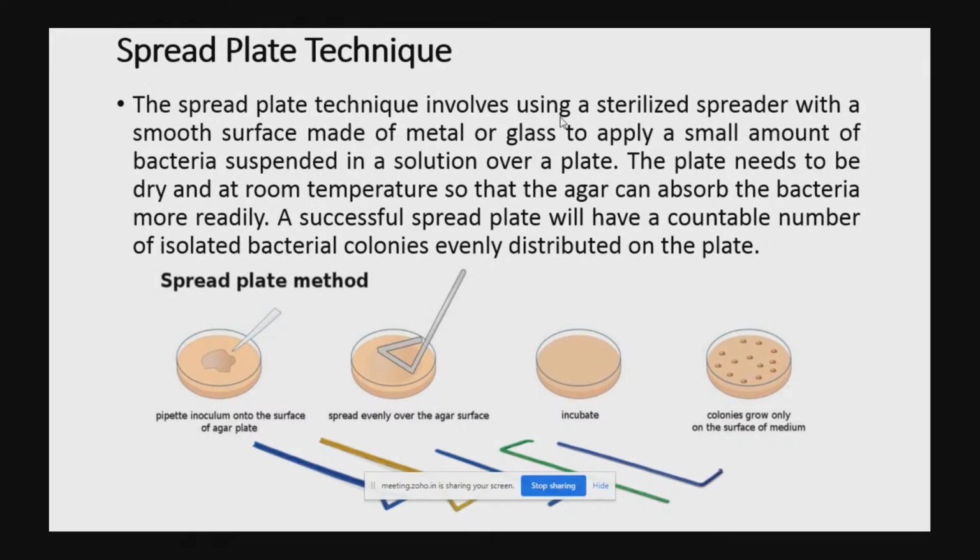So in the current scenario, to reduce the time and achieve the highest productivity in the market, many options are open. Right now, instead of glass Petri plates, plastic Petri plates are available in the market. Also, instead of a glass spreader, we can utilize a plastic spreader, which is pre-sterilized and gamma irradiated.